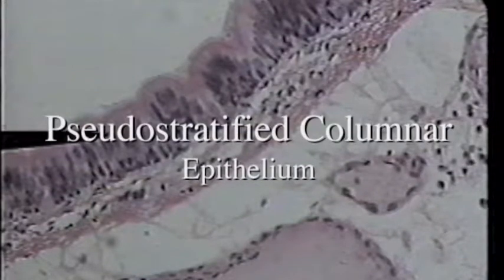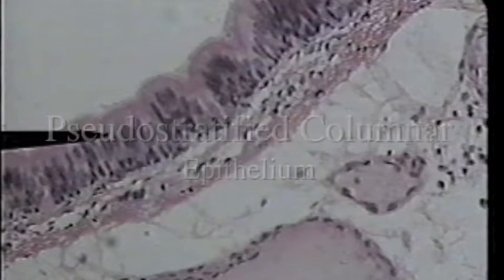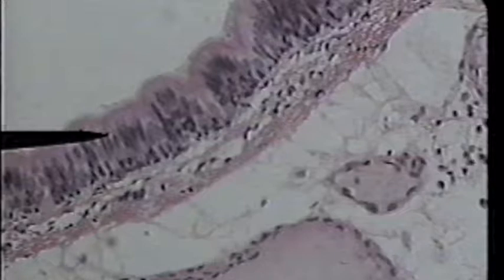We are looking at a slide that is pseudo-stratified columnar epithelium on high power. The tip of the pointer is showing the dark nuclei. As you look at this slide, you'll notice that the most apical cells, or the cells nearest the lumen, are columnar in shape. You can clearly see the pink cytoplasmic region that is nearest the lumen — that's how we can tell that these cells are columnar.